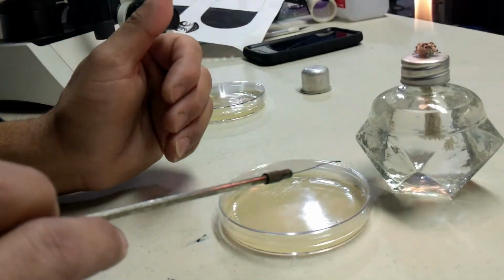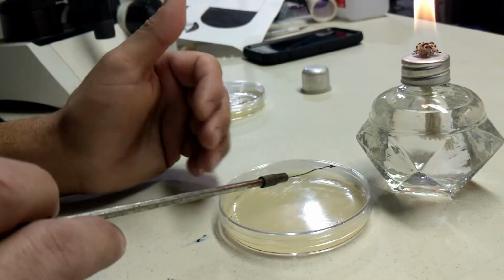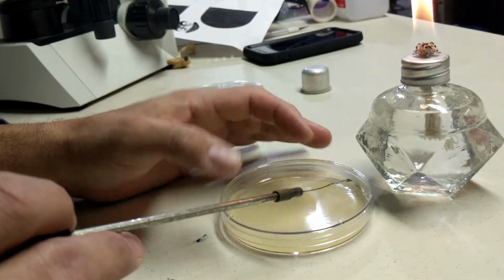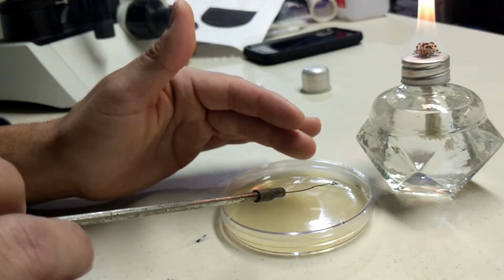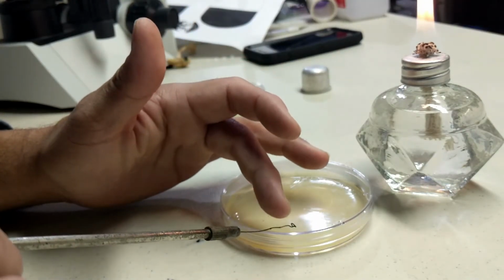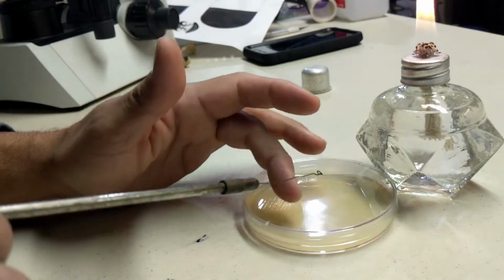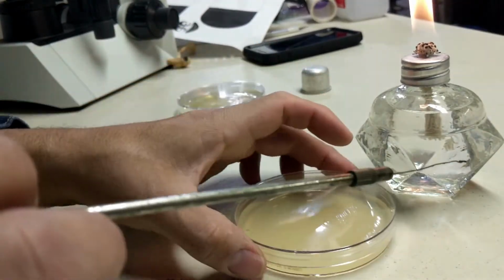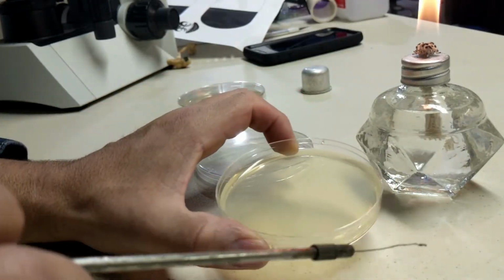So let's say that we move 50 or 25, okay? So now we have 25 in the second quadrant, and then we dilute it again. Maybe from 25 we have 10, and then from 10 we have 5, and at the end we have isolated colonies, okay?